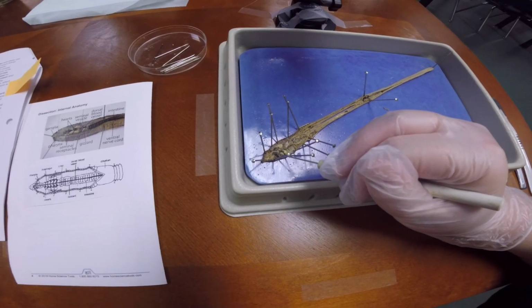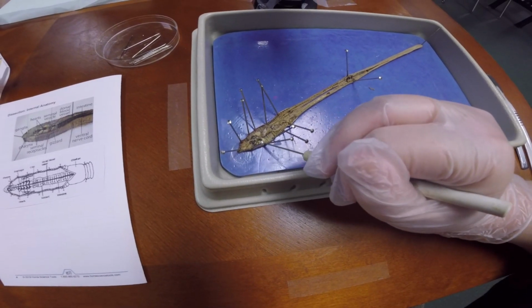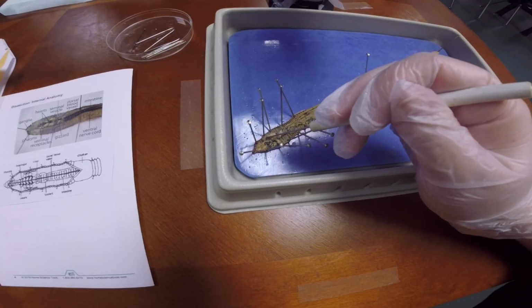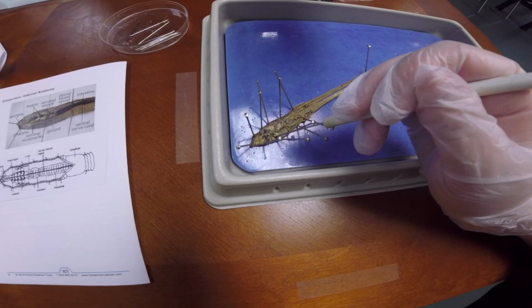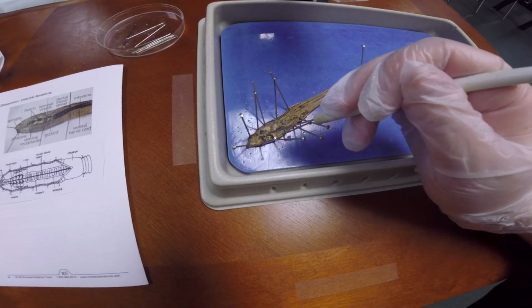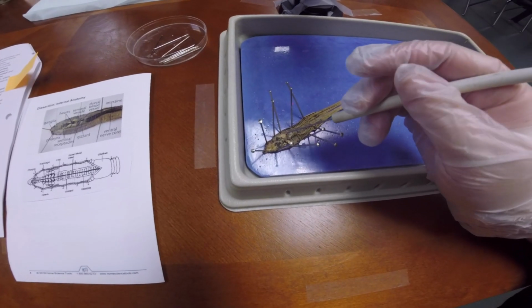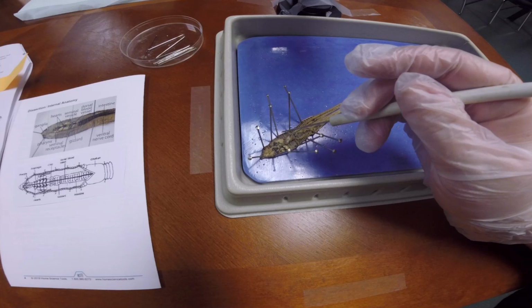Then these little darker parts right here, these are the 5 aortic arches. I accidentally cut through those guys, but you can still kind of tell that those would be part of the hearts. Okay, so that's the darker colored parts here. Then we have these bigger white pieces, which are the seminal vesicles.